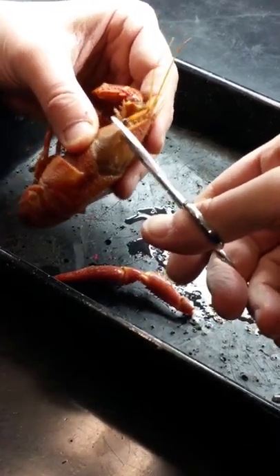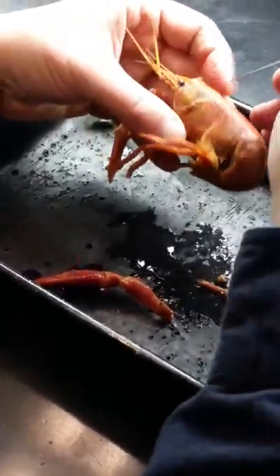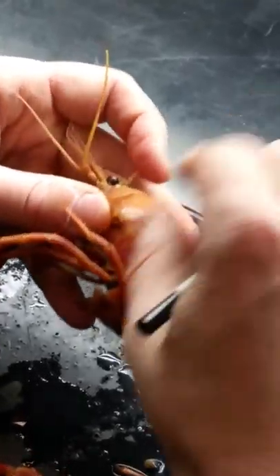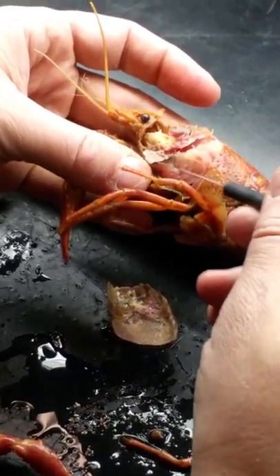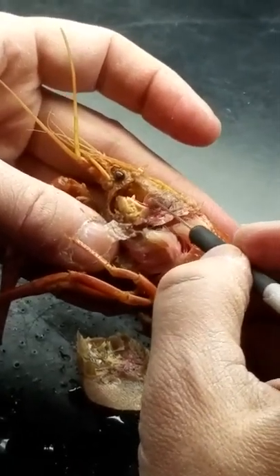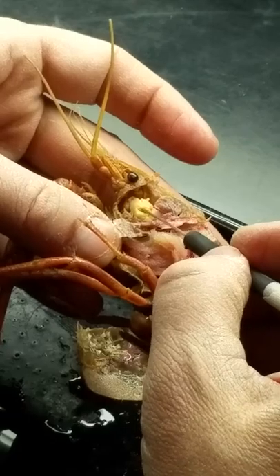Once I get that pulled off, these are all gills — that's all gill tissue there. And this right there is the mandibular muscle — we'll talk about that. This right here is the green gland and digestive gland.